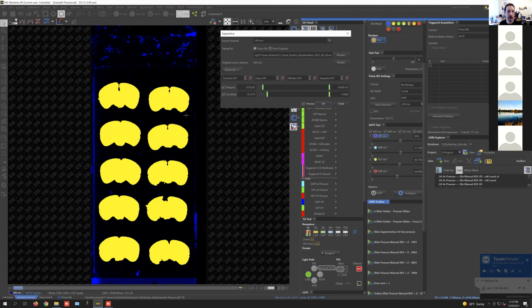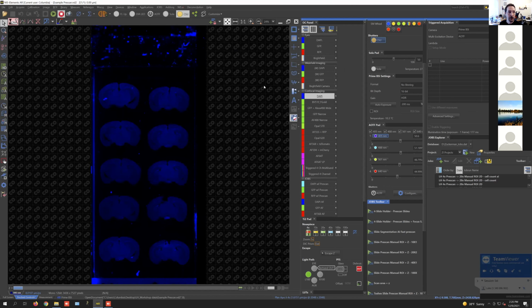Because one of the most frustrating things that comes up when you try to do this is you get something working really well for detecting your tissue and detecting the cells. You come with a slightly different experiment and it's just all completely broken, nothing's working, you have to rebuild it. And using these segment AI tools gives you something that's far more robust and reliable for doing this type of segmentation. Let's actually start building a job from scratch.